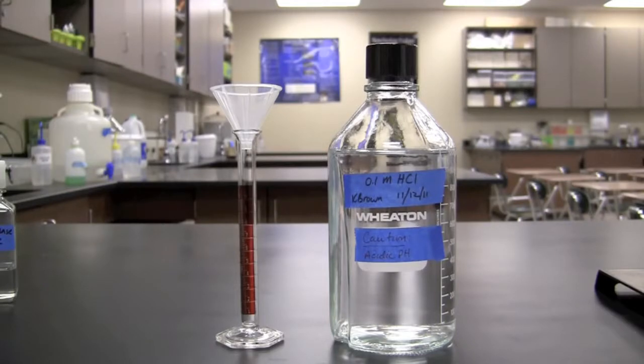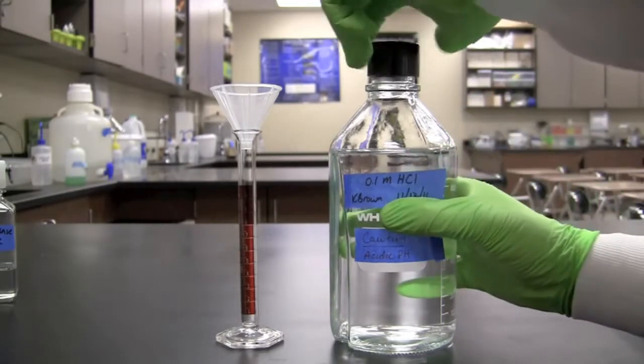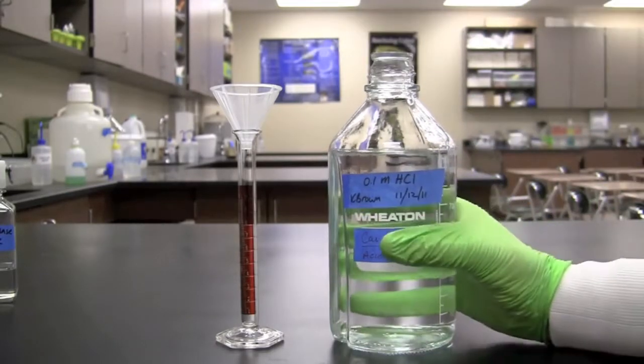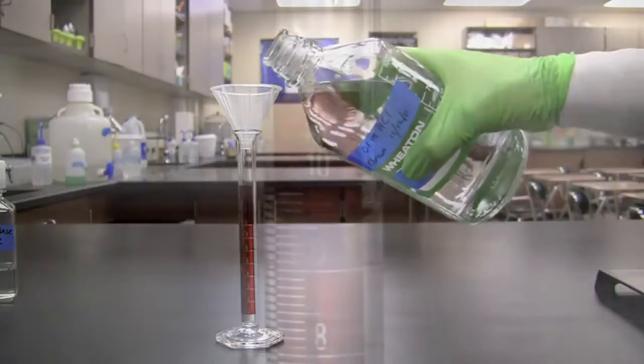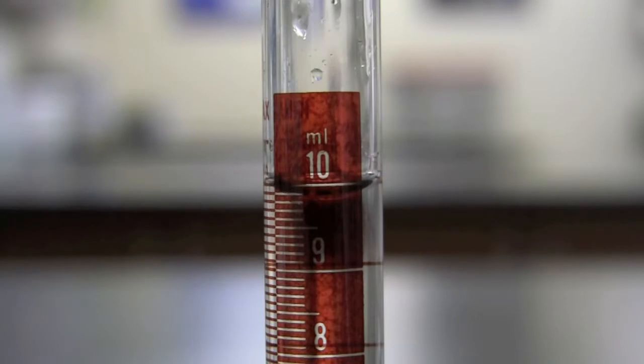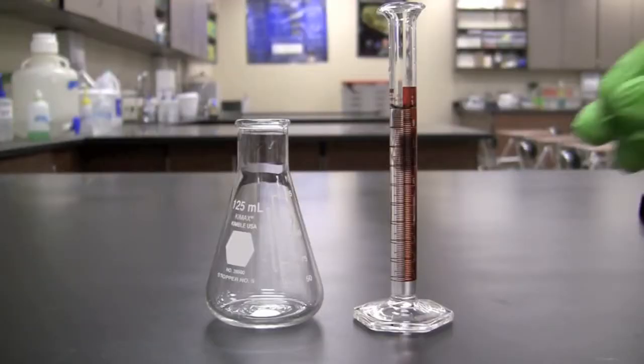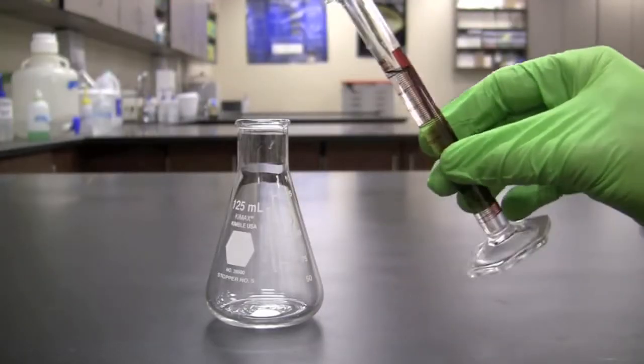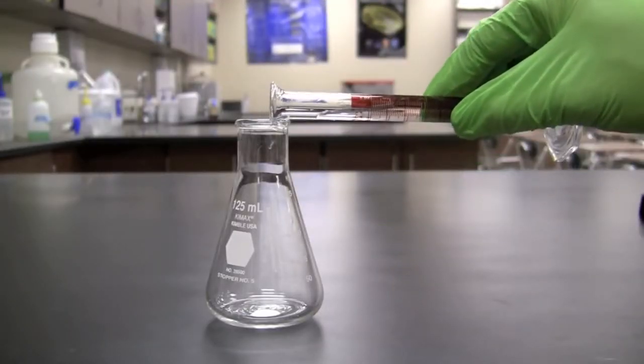Next measure 10 milliliters of 0.1 molar hydrochloric acid using a graduated cylinder. Pour the 10 milliliters of hydrochloric acid into a flask.